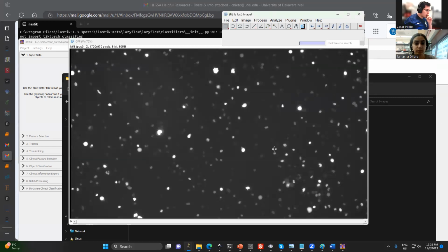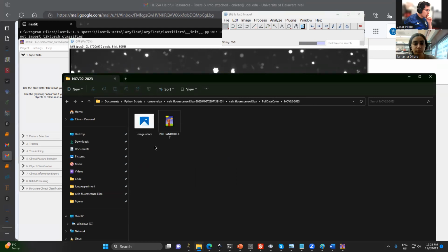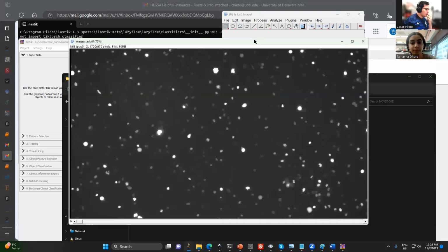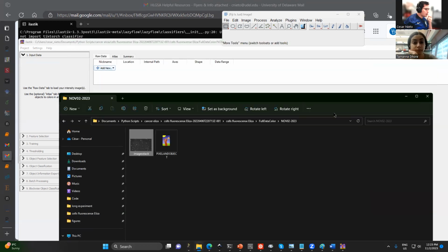Make a stack. And this is a single file where you have all the images in the same. Okay. Yeah, so you can. So let me see. I've copied here the path.